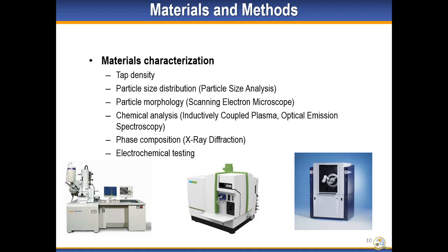In terms of material characterization, we look at the tap density, particle size distribution, particle morphology with the scanning electron microscope, chemical analysis with ICP-OES, phase composition with XRD, as well as electrochemical testing.